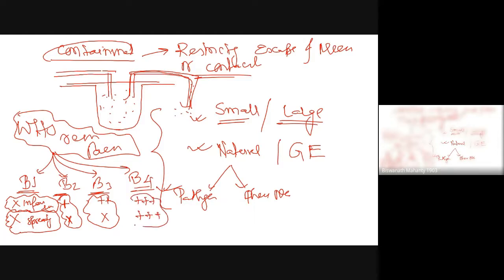And you know one example of this at this moment, right? SARS-CoV-2, right? We are already dealing with one in this pandemic, which is infectious as well as spreading. It is really dangerous for the person, and it spreads into the community. So depending on what kind of microorganism you are dealing with, we can have B1, B2, B3, B4 biosafety protocols in the lab where you are working, in the research lab you are working.